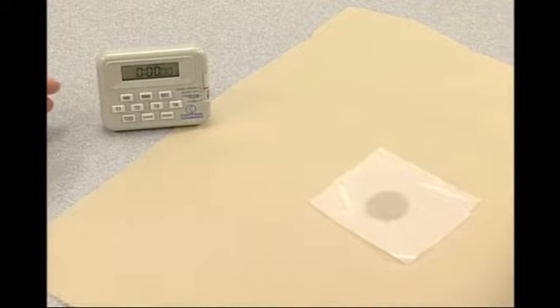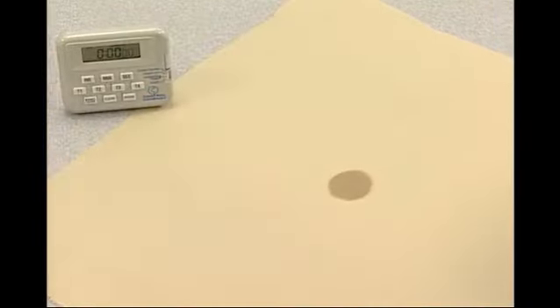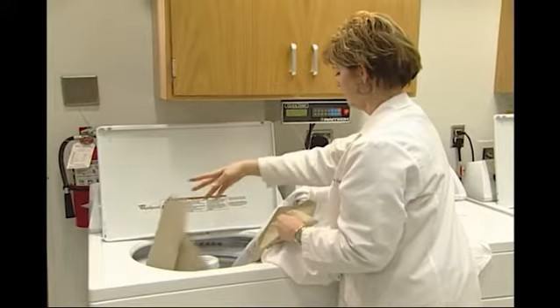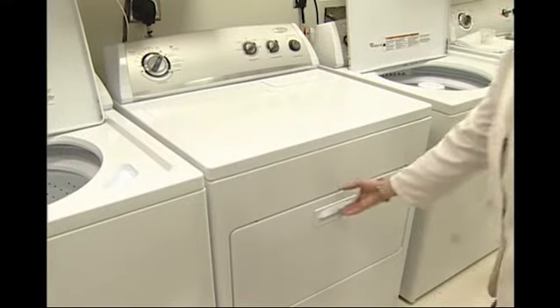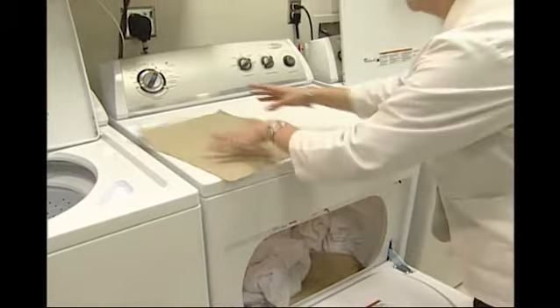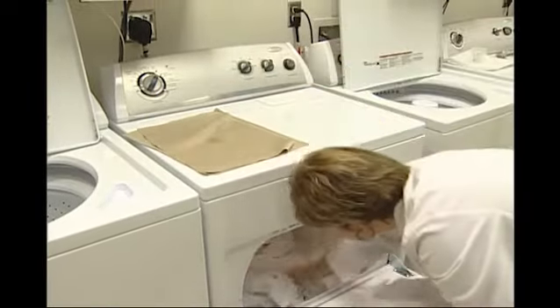The specimen is allowed to lie undisturbed until it's laundered, within 20 minutes of the oil application. After one laundering at prescribed washer and dryer settings, the specimen is conditioned for at least 4 hours before it's rated. It should be noted that in some cases, fabrics are laundered before the oil is applied, so that any residual finish that might interfere with stain release evaluation is removed.